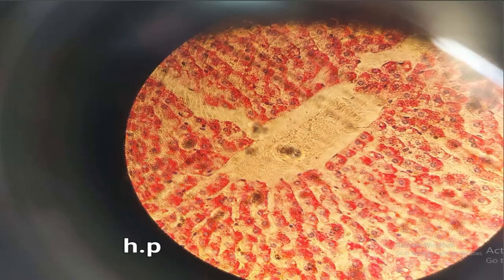So in this slide, you'll be able to see the liver being stained, and most of these cells are on one side. These red ones are glycogen molecules which have been stained by PAS, and then you have these black spots which are just the nuclei. You need to make sure that you are able to draw a few cells from these cells.